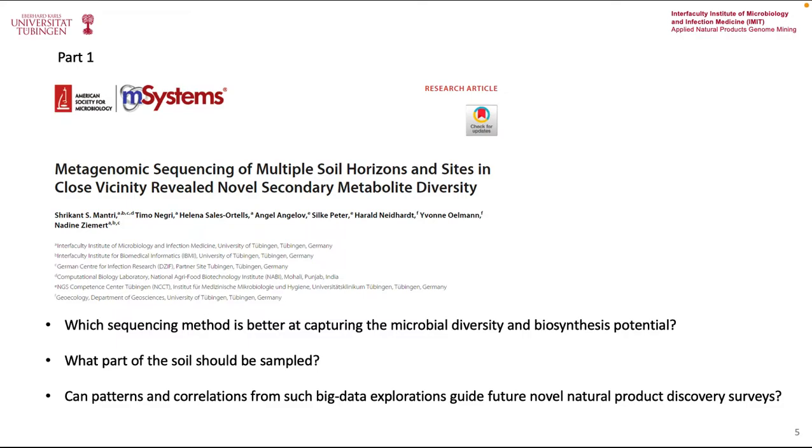This project was mainly about our pilot exploration into studying hidden biosynthesis potential present in the soil. We actually wanted to answer the following questions in this study. Which sequencing method is better at capturing the microbial diversity and biosynthesis potential? What part of the soil should be sampled? Can patterns and correlation from such big data exploration guide the future novel natural product discovery surveys? We have tried to answer these questions in this mSystems publication.